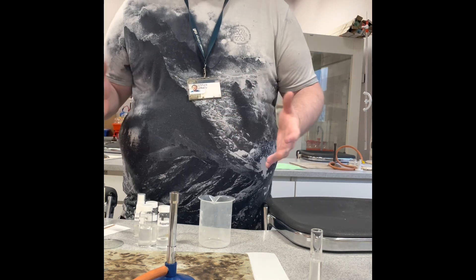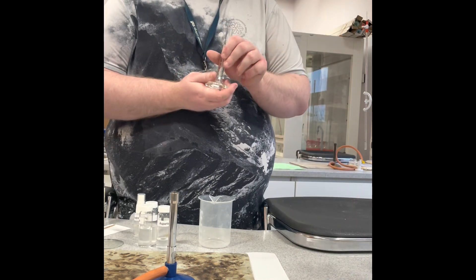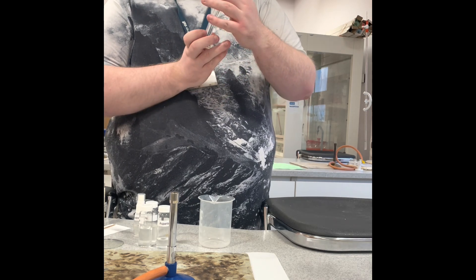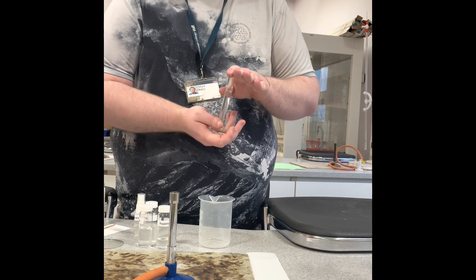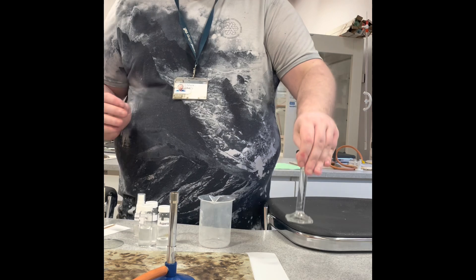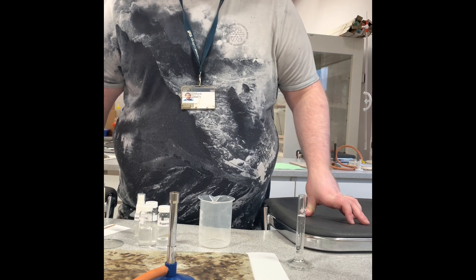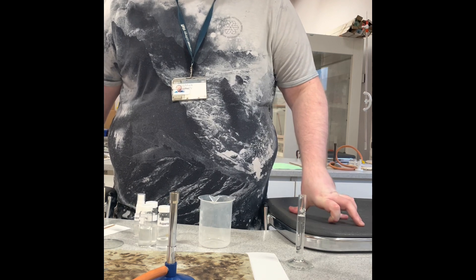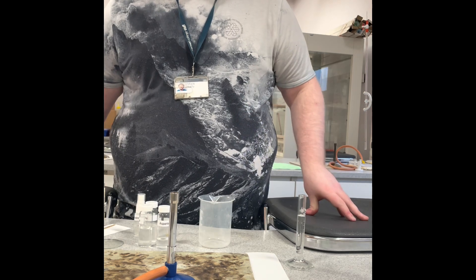The chromatography solvent we're using for this practical is six parts butan-1-ol, one and a half parts glacial acetic acid (ethanoic acid), and two and a half parts distilled water. It's important that your chromatography solvent is relevant to what you're testing for — if you use the wrong solvent, you won't get the right results and you'd have to repeat the whole process.